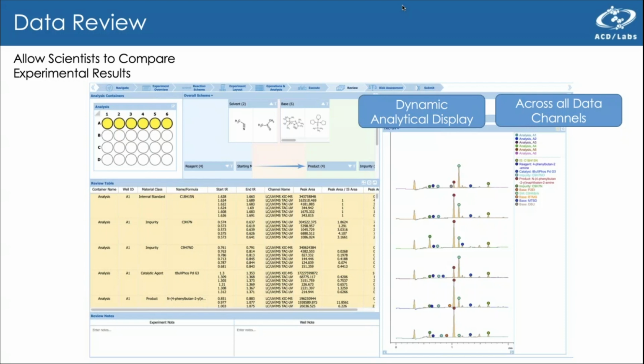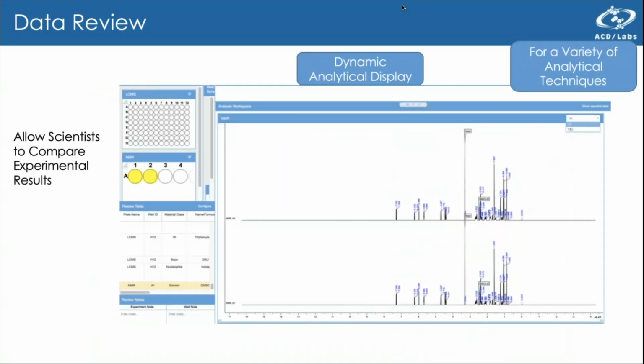I don't want to necessarily rely on the numerical output from my analysis unless I have a good sense that the processing is suitable for my particular assay, okay? And that stack plot gives you real flexibility there, that I can see the results and gain some trust based on visualizing the results, and then have some good trust based on what's in the review table, okay?